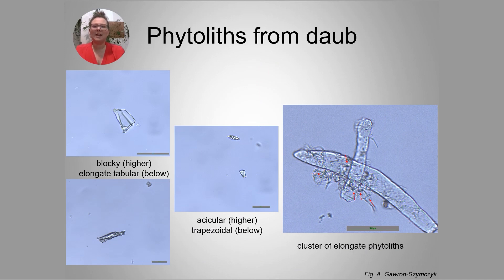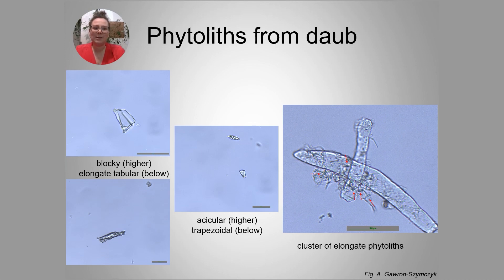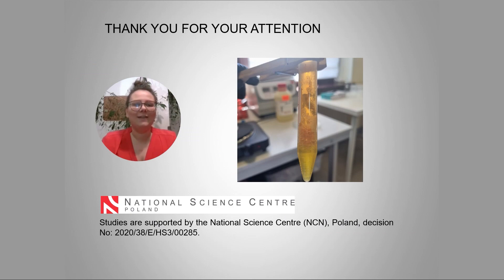Phytoliths of various shapes and sizes are visible microscopically. In the first, second, and third pictures, we can observe probably grass silica short-cell phytoliths. In the fourth picture, we can see long-cell phytoliths, probably of epidermal projection. Currently, it is difficult to assign them to specific species because we do not have a comparative database yet. However, based on the study of grass phytoliths from the Falkland Islands, it is certain that the distinction of species is possible, even when it is impossible to distinguish species based on pollen. Work is underway on a comparative collection.